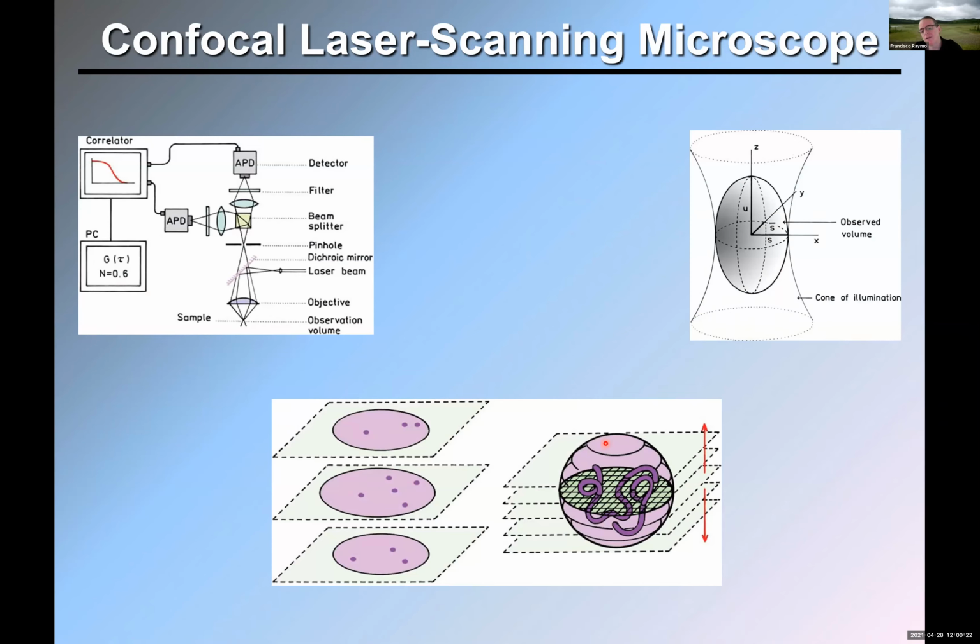Okay. So you can even do, let's say if this is a solution, like you have molecules that are swimming in a petri dish. You can still scan your beam across the solution and acquire an image. Of course, diffusion will be significant. Some molecules will move everywhere. So you will see probably fluorescence everywhere, but it can be done. So, it is generally used more for biological systems or solid samples? Since the samples are solid, but there is no reason why not to do it with liquids. Yeah, the microscope is compatible also with liquids.